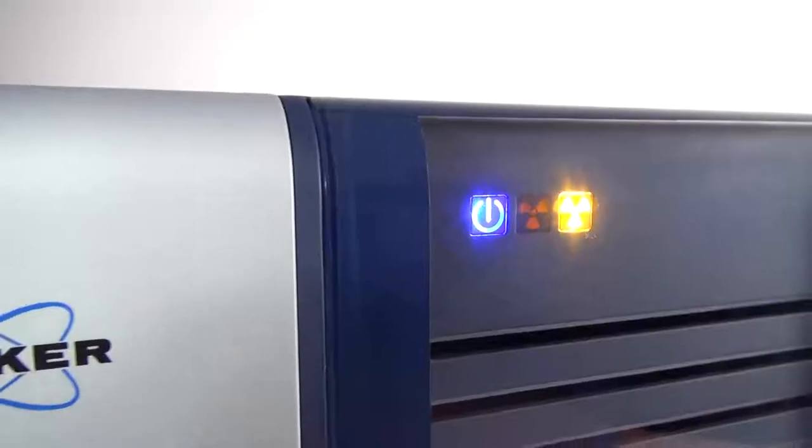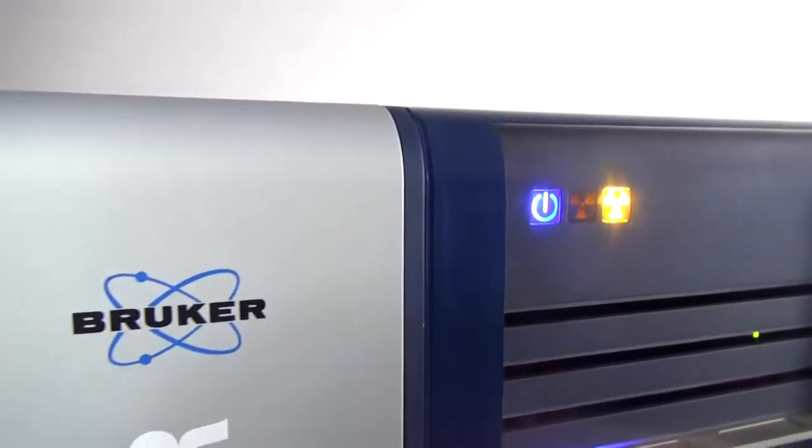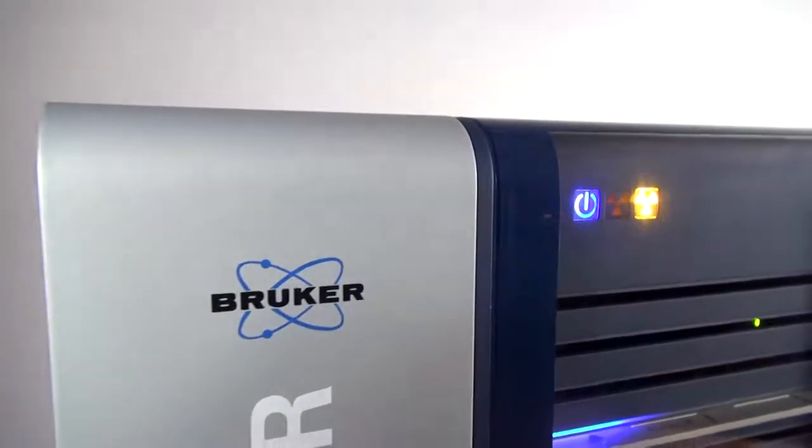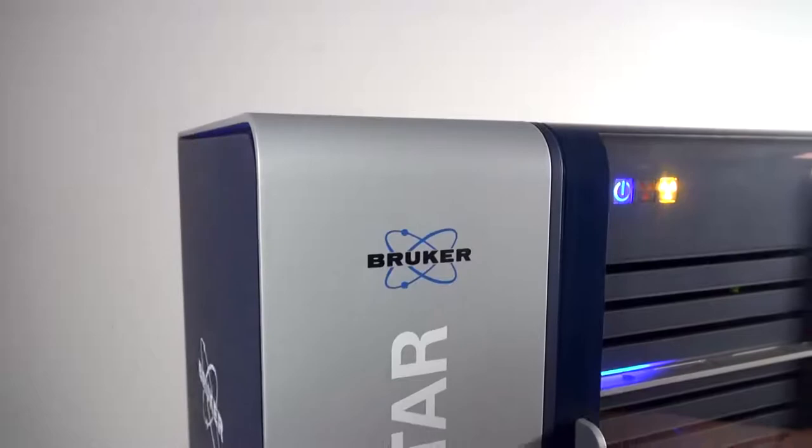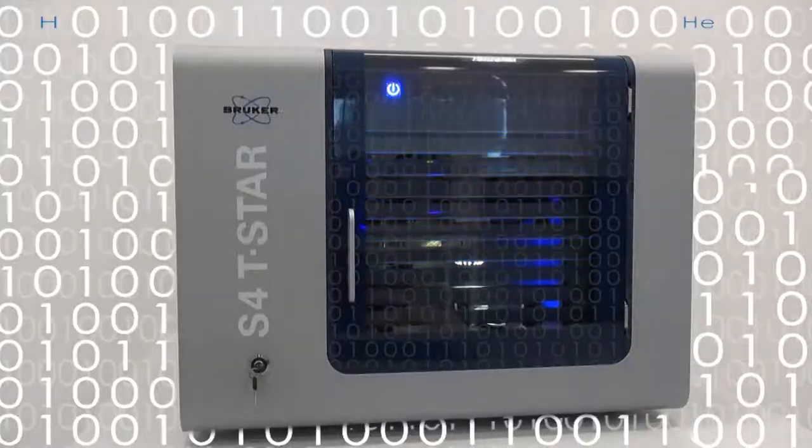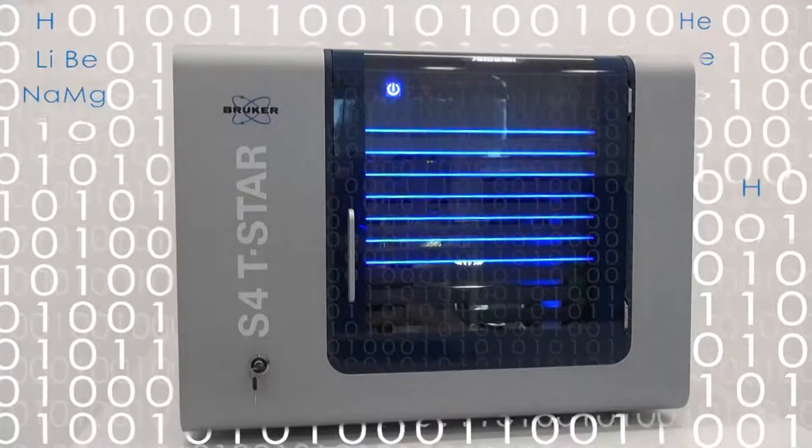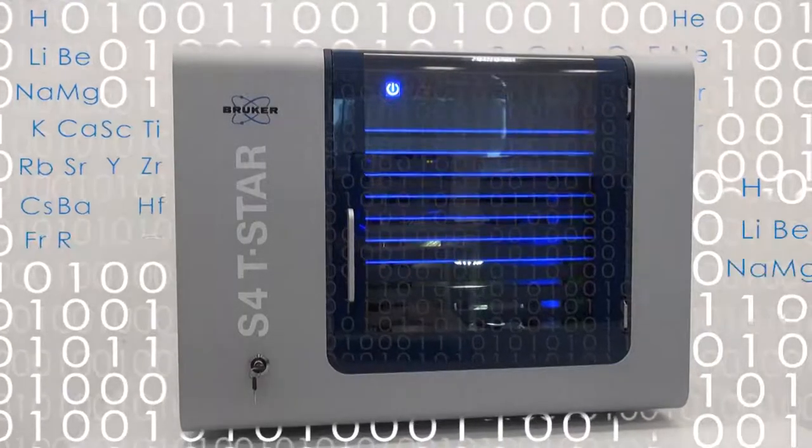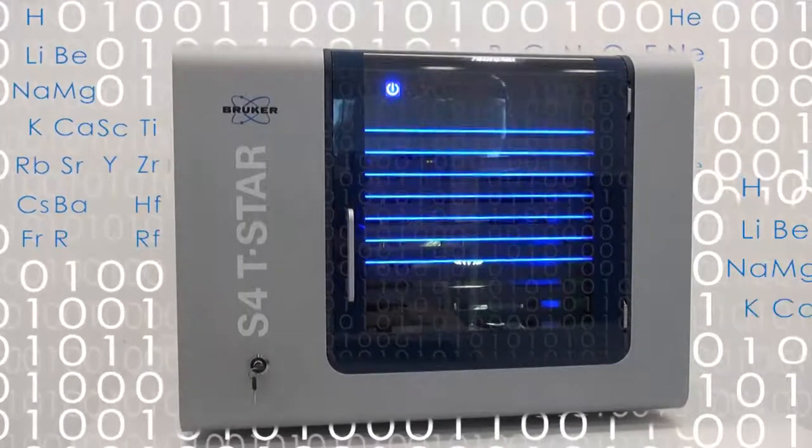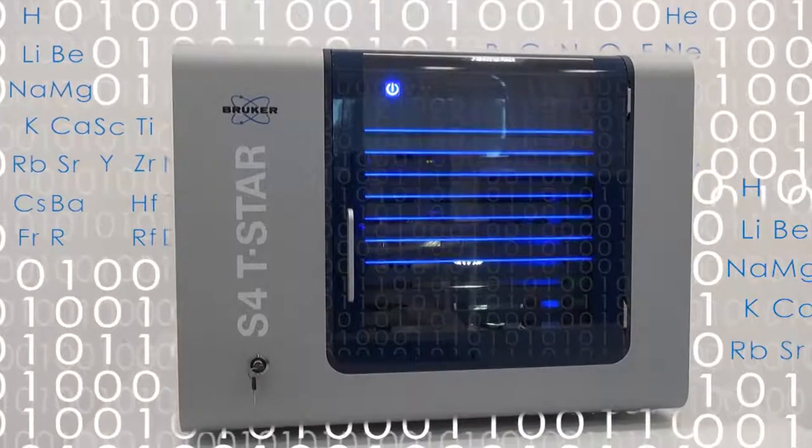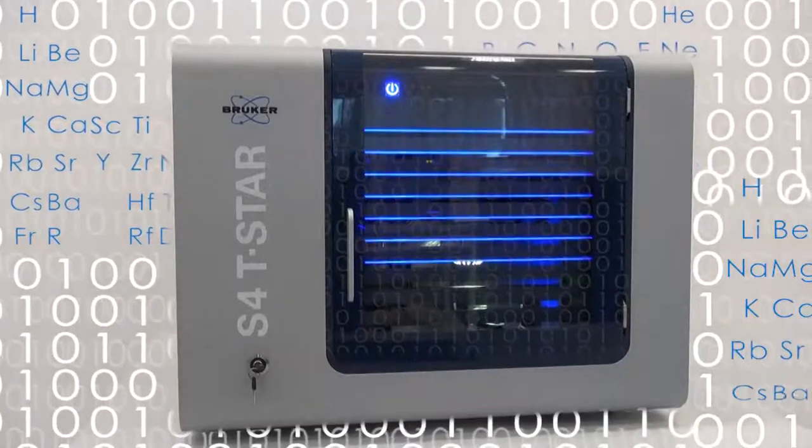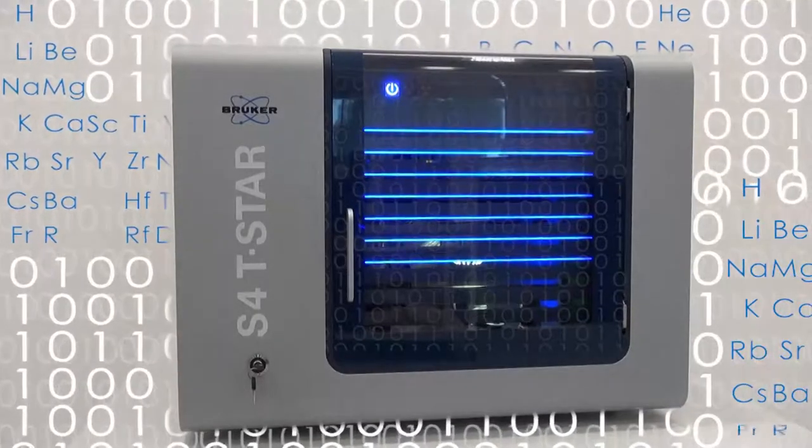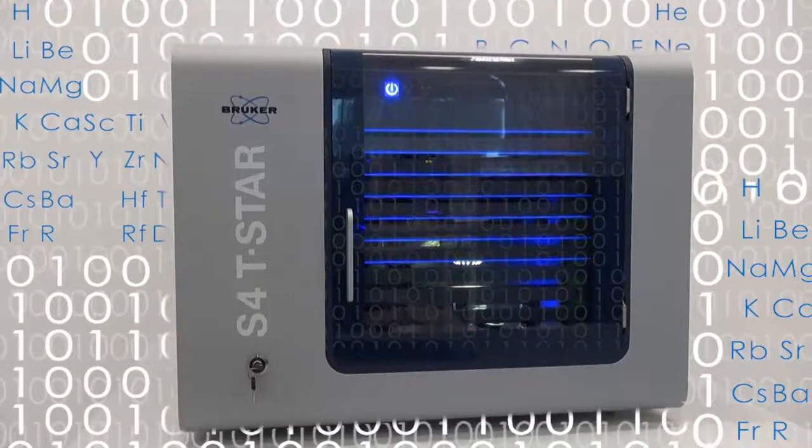The S4 TSTAR is the first TXRF spectrometer that automatically runs quality check routines in the background, utilizing internal quality control samples to monitor and stabilize crucial system parameters.